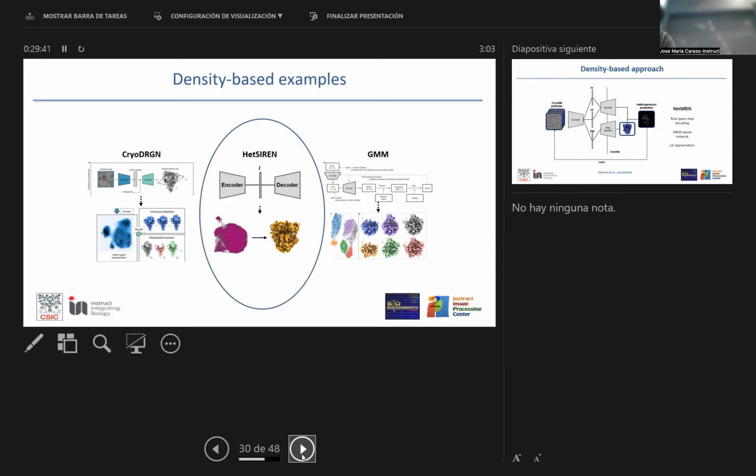Yes, because with the flexibility I am putting more mathematics into the whole thing, but I am able to take this mathematics into the reconstruction and get an enhanced reconstruction. With the density-based approximation, we don't yet know how to do it.